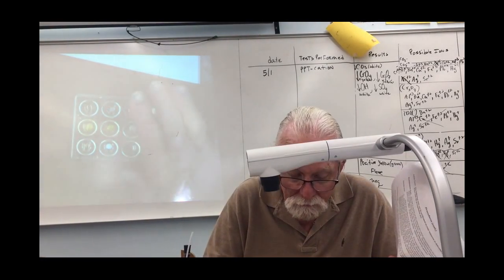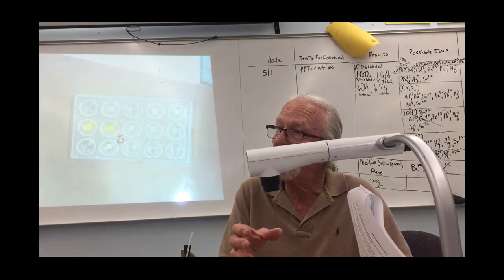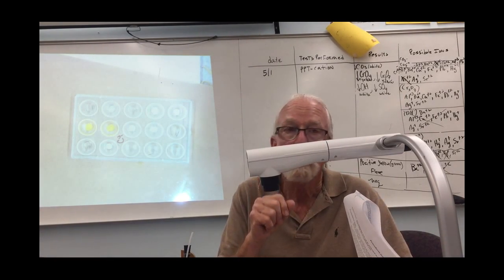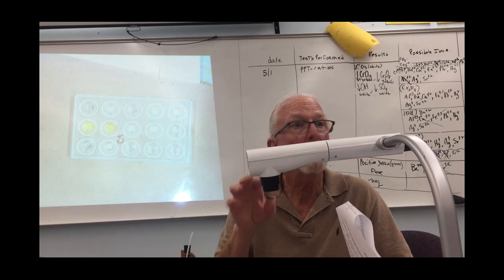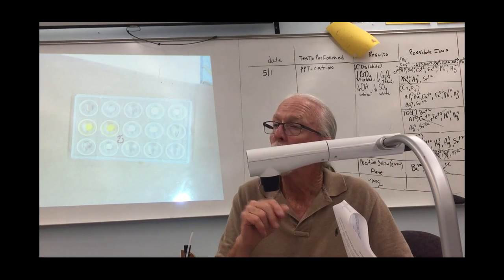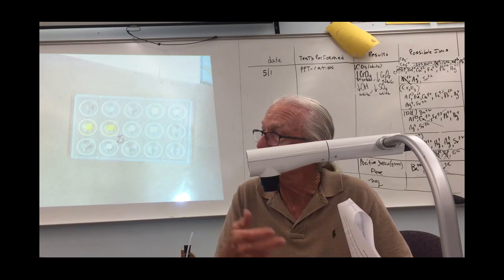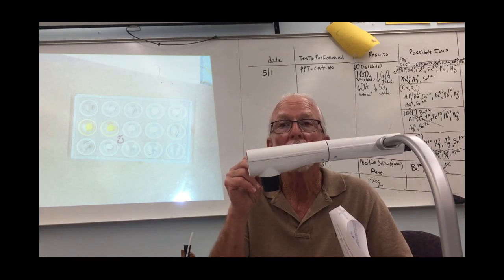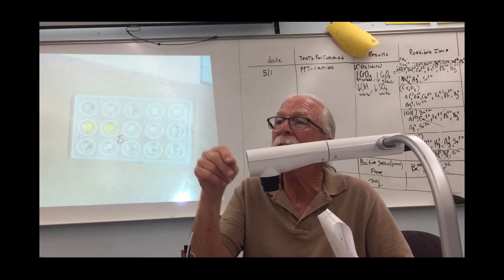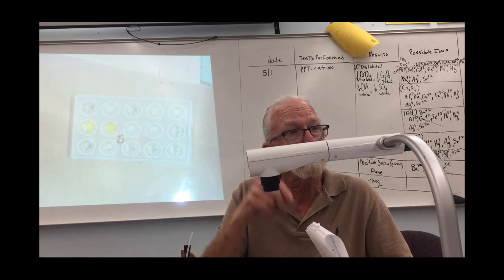Now, I want you to think about something. If I took a clear glass of water and I mixed with it orange Kool-Aid, what color would the resulting solution be? Orange, right? If I mixed orange liquid with clear, it's going to be orange. So you have to be careful. If the liquid has already got a color, it can hide the color of what the precipitant really is.